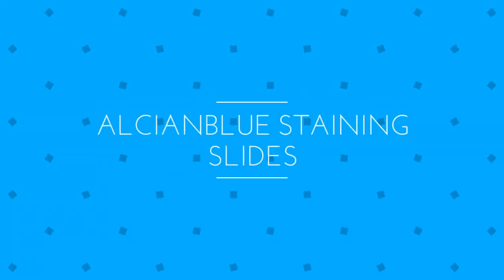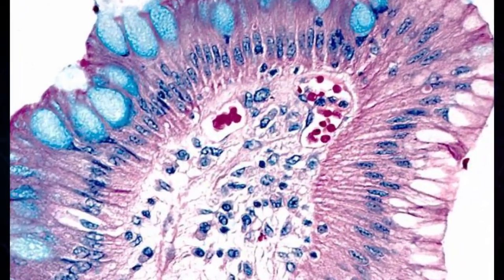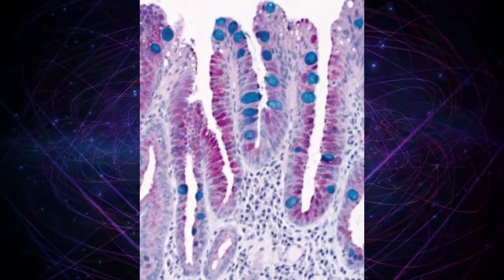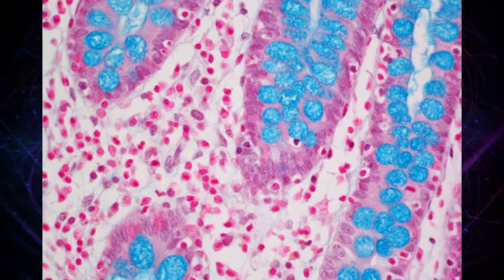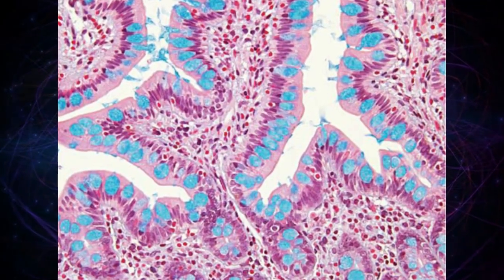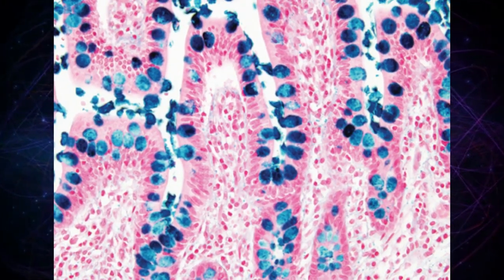Alcian Blue Staining. Alcian Blue is a basic dye that has an affinity for acidic tissue elements like mucin. Neutral mucins are not reactive with Alcian Blue. The tissue parts that specifically stain by this dye become blue to bluish green after staining and are called alcianophilic.